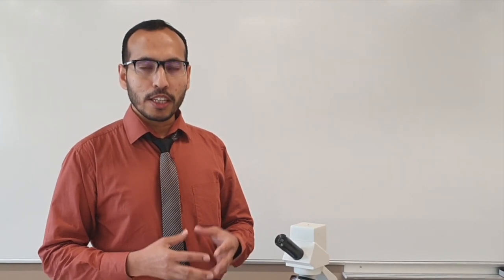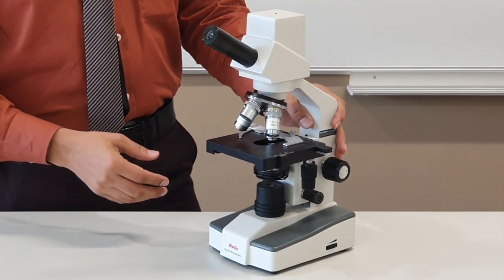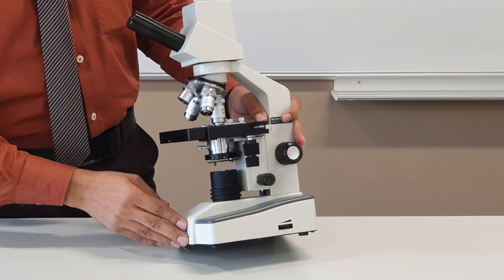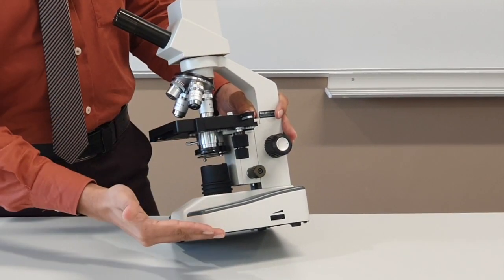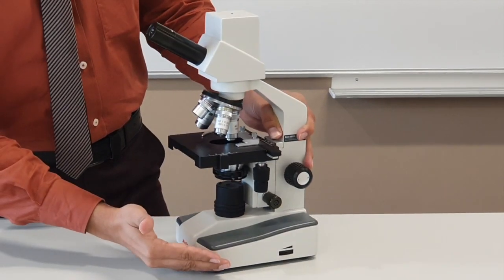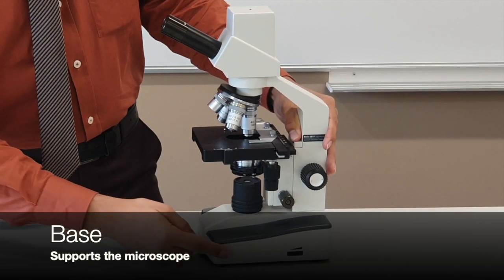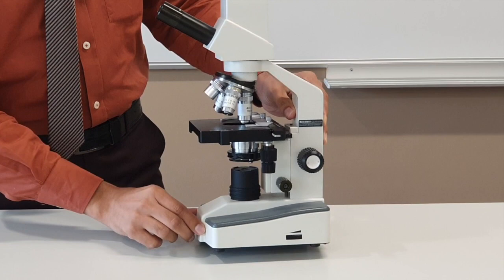Now I will explain each and every part of the instrument microscope. The most important thing is that you can explain from bottom to top or top to bottom. First of all, the base. This part that you see is the base, which is very important to support the microscope so that it doesn't fall.